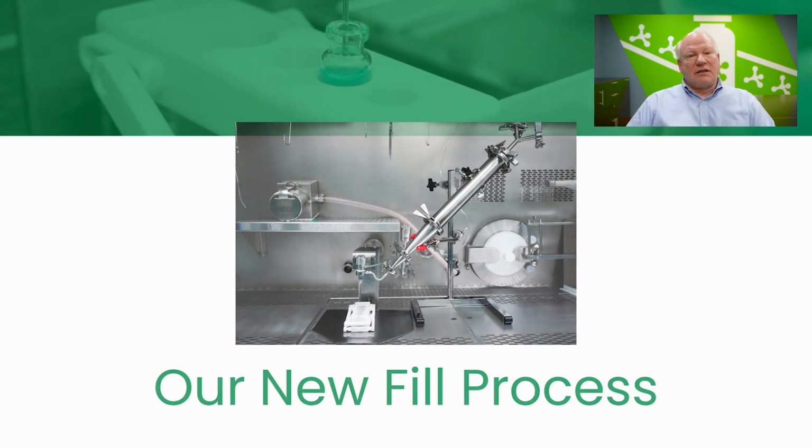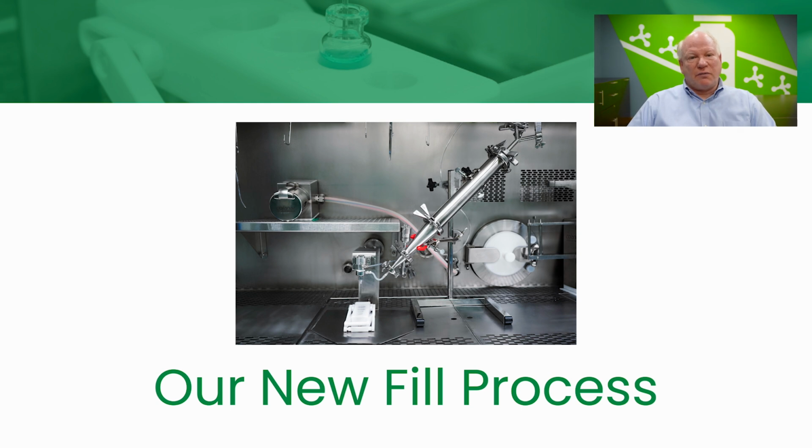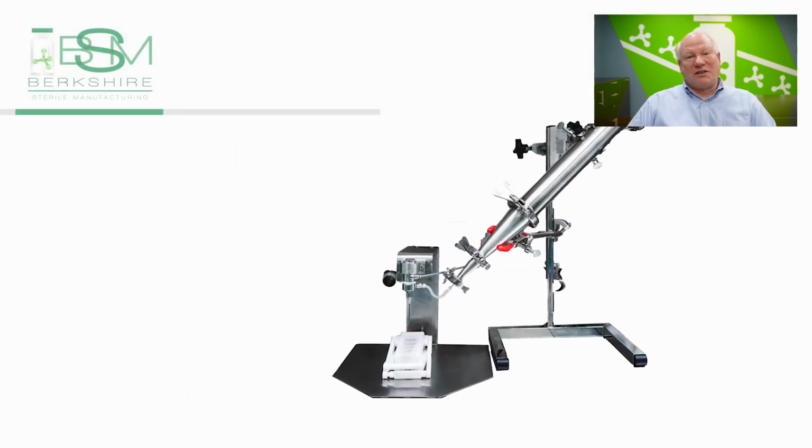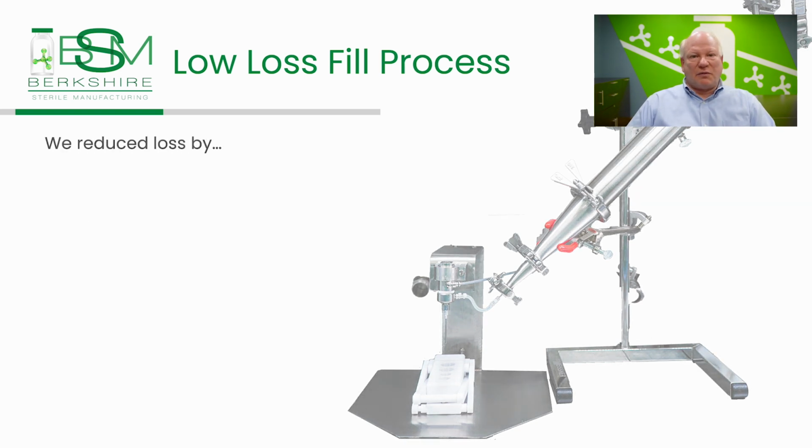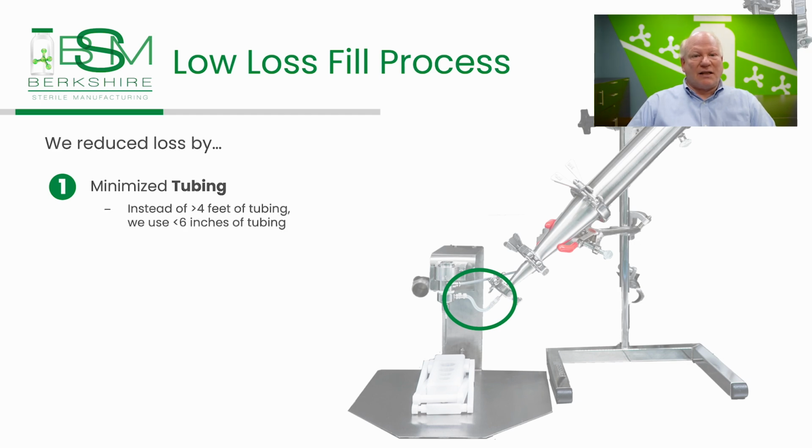This is when we designed a new filling process with the goal of pushing product loss to its minimal limit. Through this new process, we successfully reduced drug product loss to a remarkable range of just 5 to 10 mils for each batch. When accounting for filter holdup, the overall loss remains under 30 mils. This achievement was made possible through several key strategies. We substantially reduced the length of tubing in the process. What used to be 4 feet of tubing in our other filling lines has been condensed to just 6 inches or less in this line.